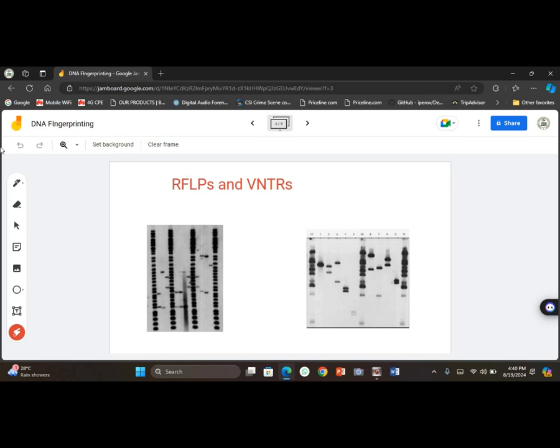So what you have on the original gel is what we are going to have on the nylon membrane. After that, the membrane is prepared to undergo its probing phase. The purpose of the probing phase is to compare that pattern with the pattern of the exemplar, so that you can see that both of them are the same.